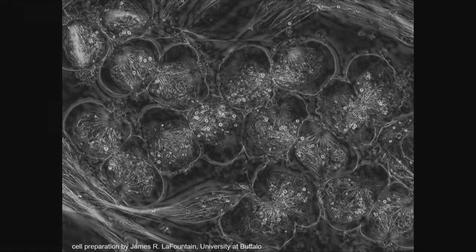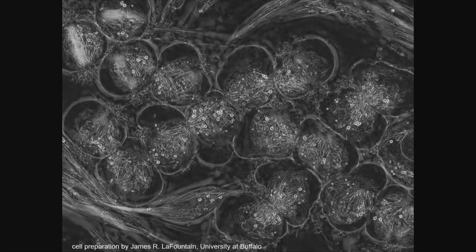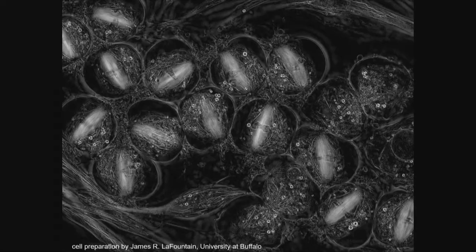Let's see here. Aha. Yeah, so hold on. Here. So this is a field of cells. These are spermatocytes from a crane fly. A colleague of mine makes these beautiful preparations. This is one time point, and you can see that this is one cell, this is another cell. They are synchronized by some means, and they have built a spindle.